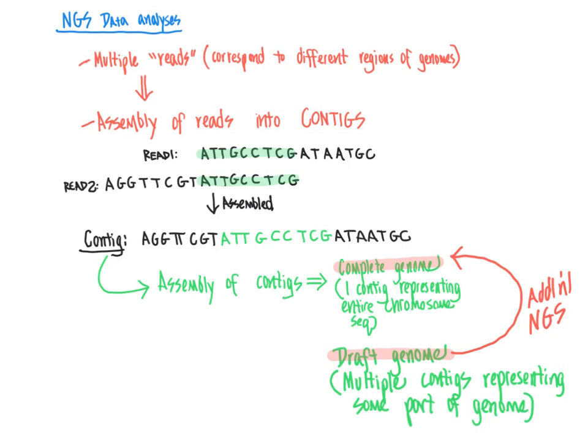So very commonly, people will do a hybrid sequencing experiment where they sequence a genome using short read sequencing techniques to generate a bunch of fragments of 35 to 700 nucleotides, and they'll complement that by doing a long read experiment where they generate fragments of sequences that are greater than 700 nucleotides and assemble all that together to ultimately create a complete genome sequence for an organism.